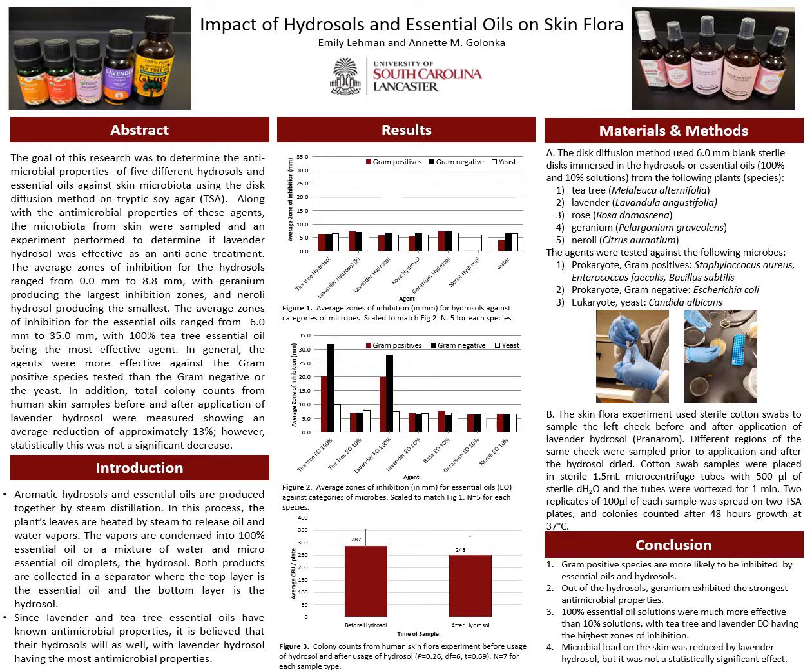And then comparing figure 1 to figure 2, we can still see that the tea tree 100% essential oil and the lavender 100% essential oil still have the highest antimicrobial properties. But after that, none of the hydrosols and none of the 10% essential oil solutions had zones of inhibition over 10 millimeters, and the geranium hydrosol actually had a higher average zone of inhibition compared to the 10% solution essential oil.